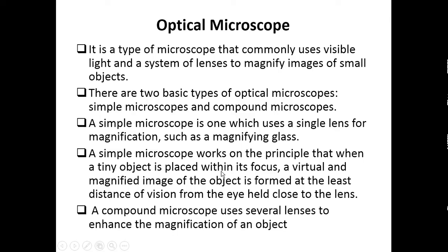Okay. So simple microscope is the single, one lens microscope. That is, simple microscope is one which uses a single lens for magnification, such as a magnifying glass.